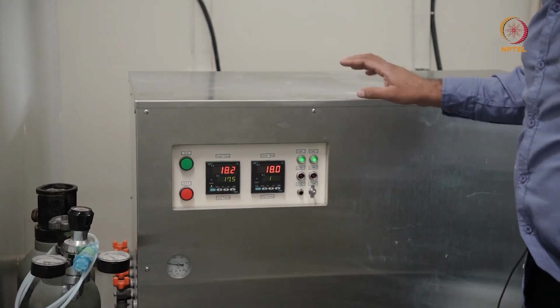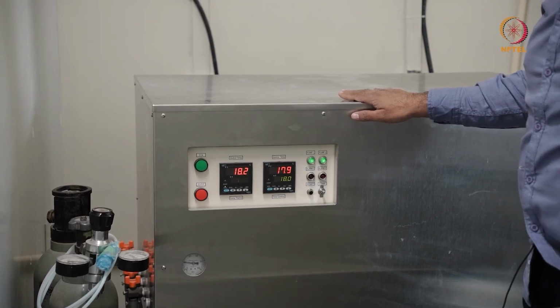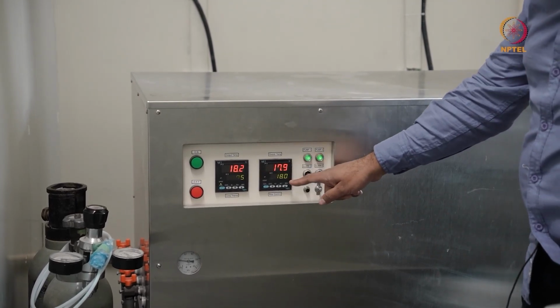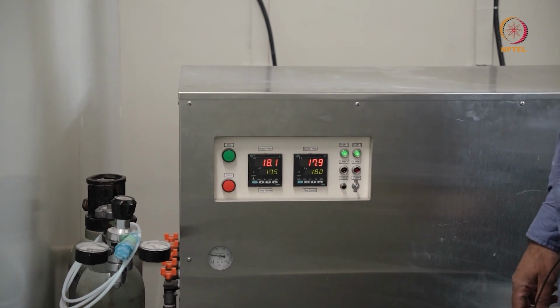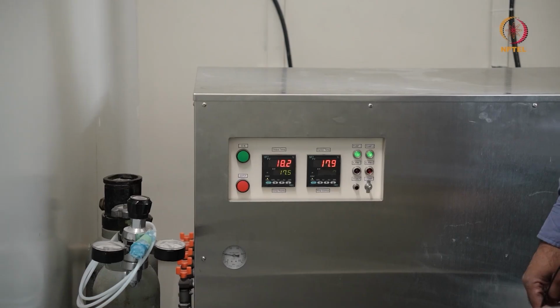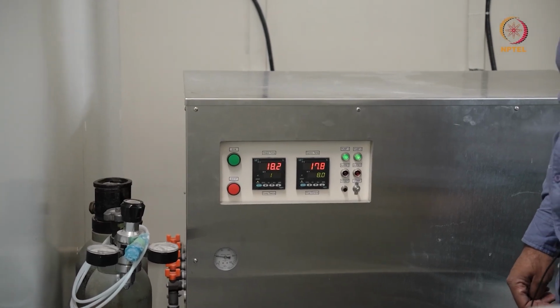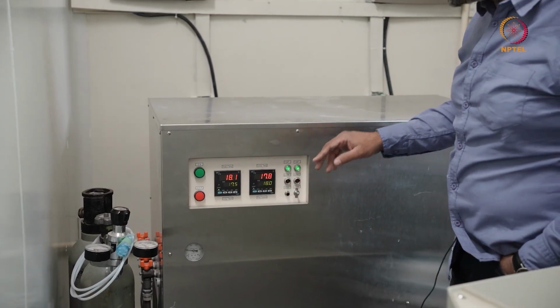So if you look at a chiller, this is how a typical chiller connected to an electron microscope, a TEM, looks like. You can see the readings here. It just gives you the temperature of the water that is being circulated in the microscope column. Remember, when you're using electromagnetic lenses, they often get heated up, and to maintain the lens at a uniform temperature, you're circulating chilled water.